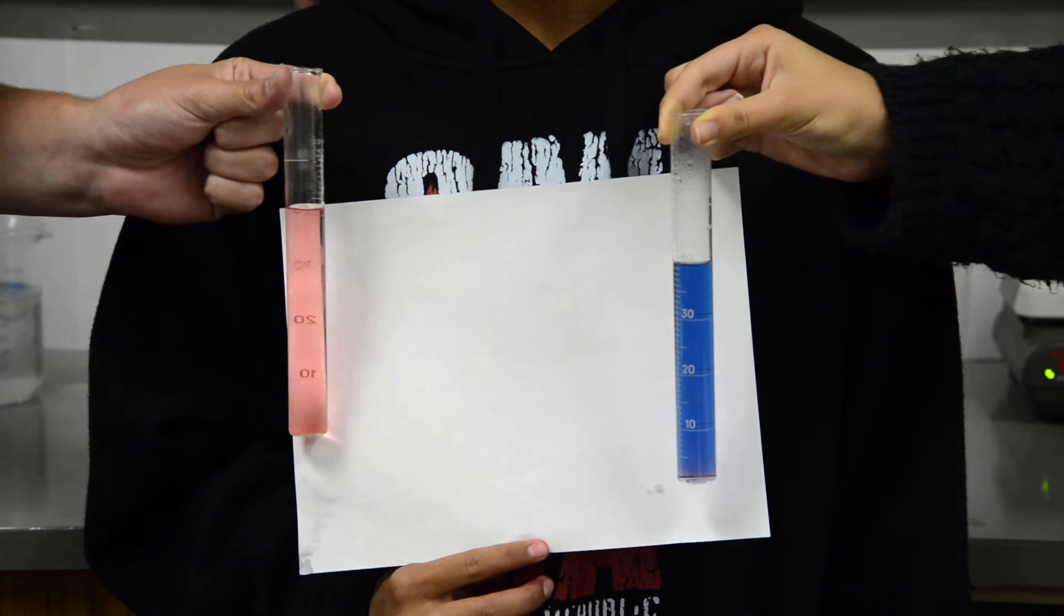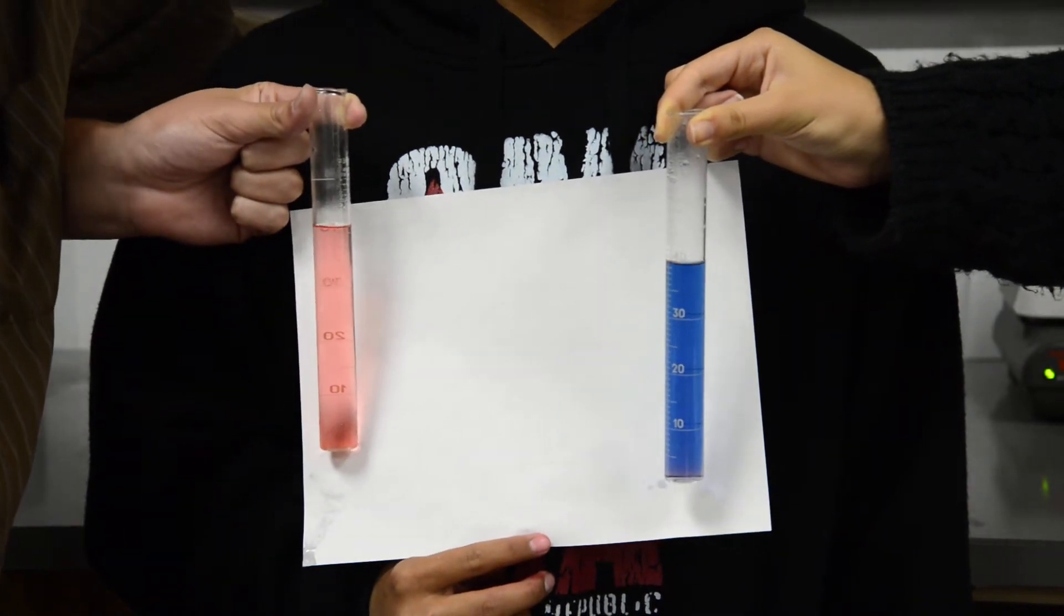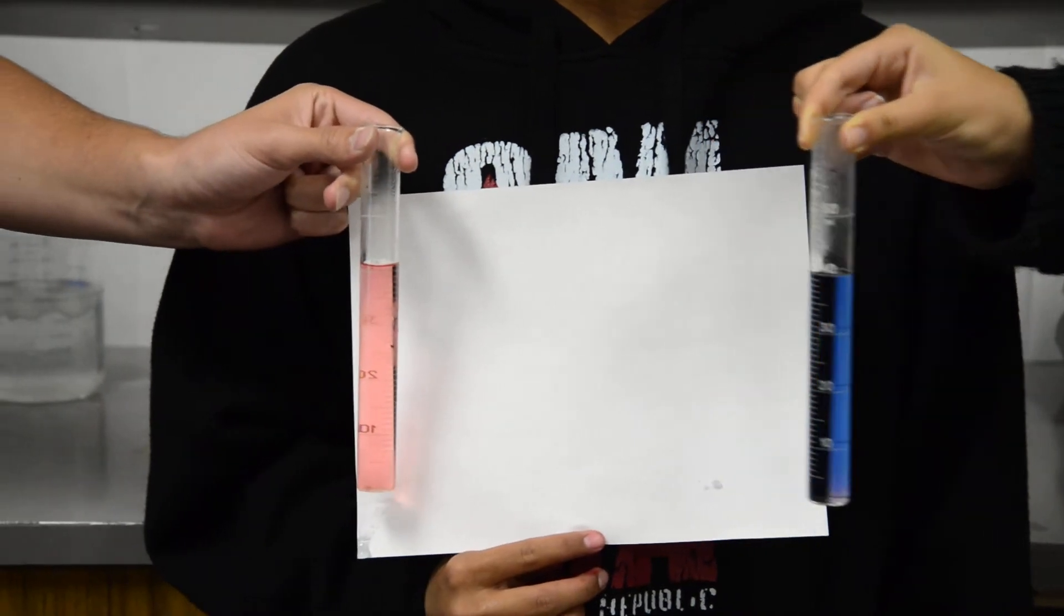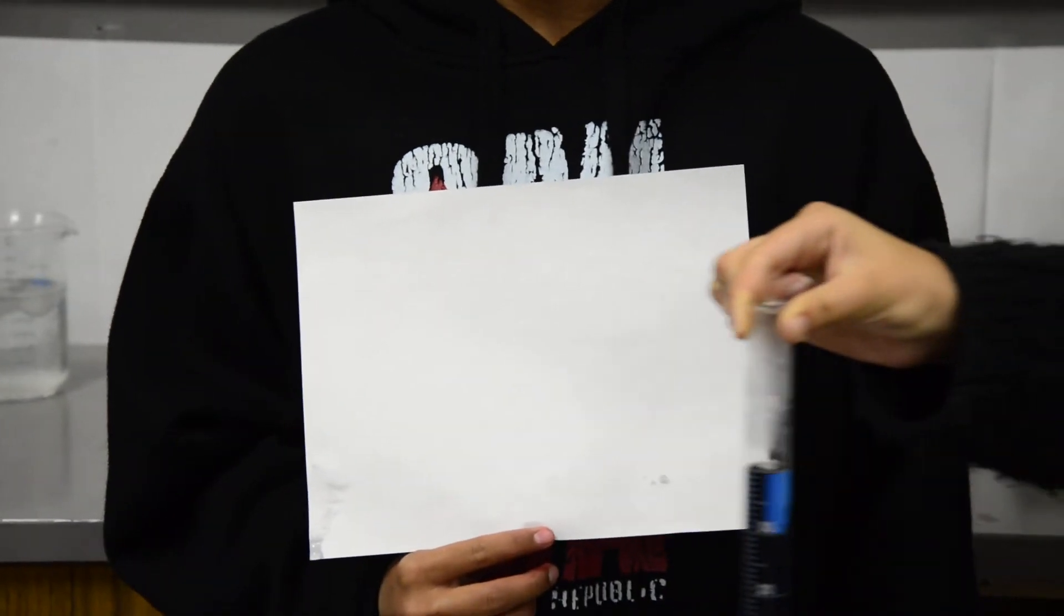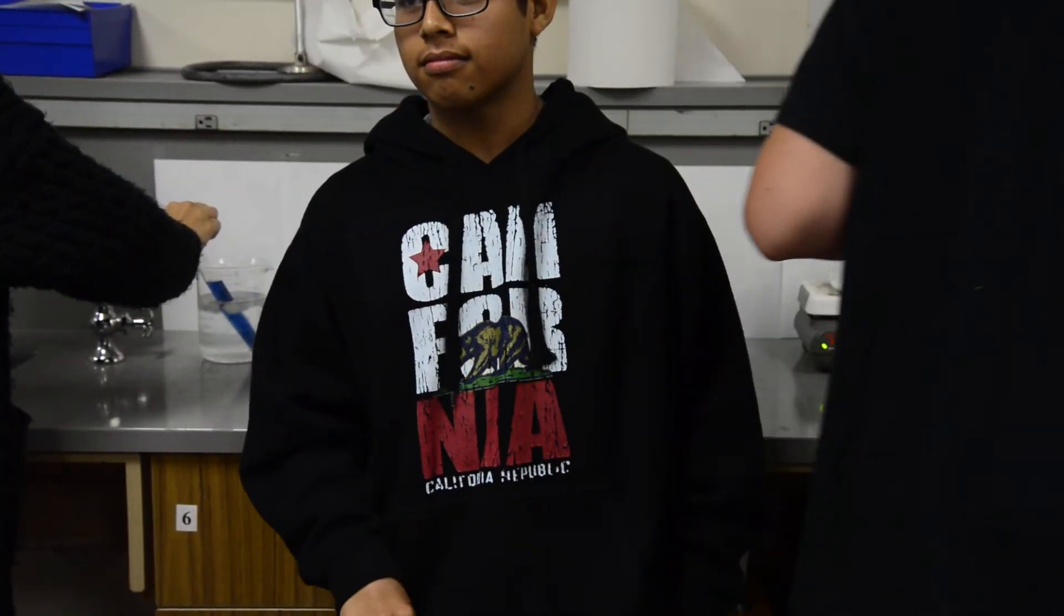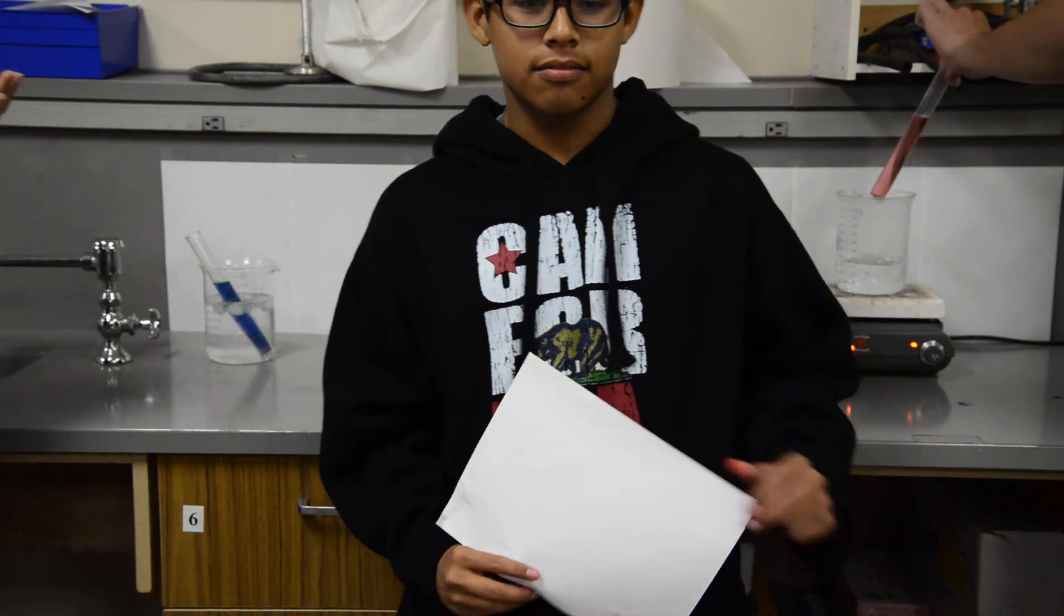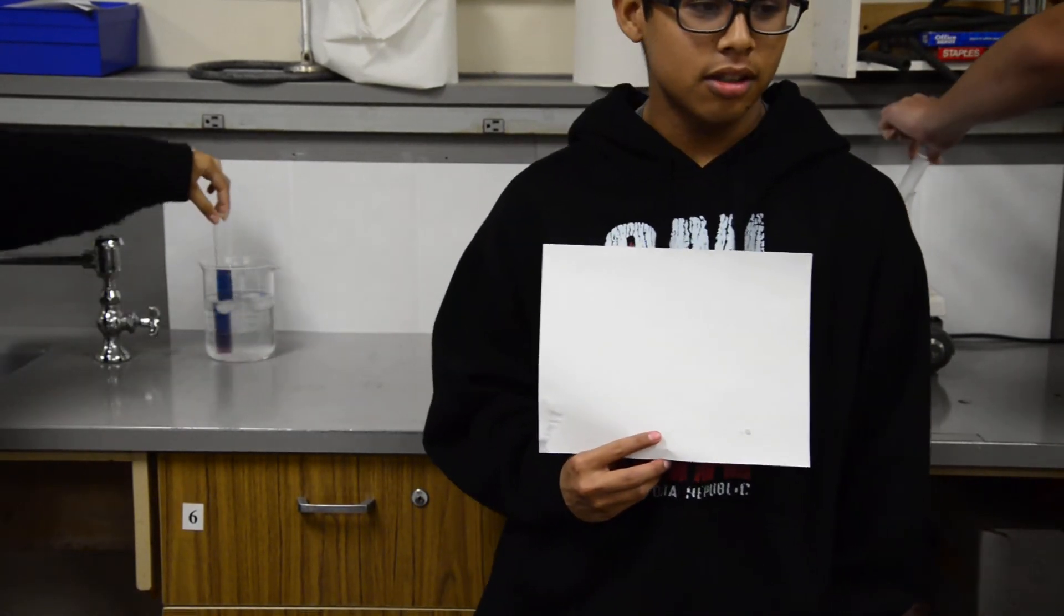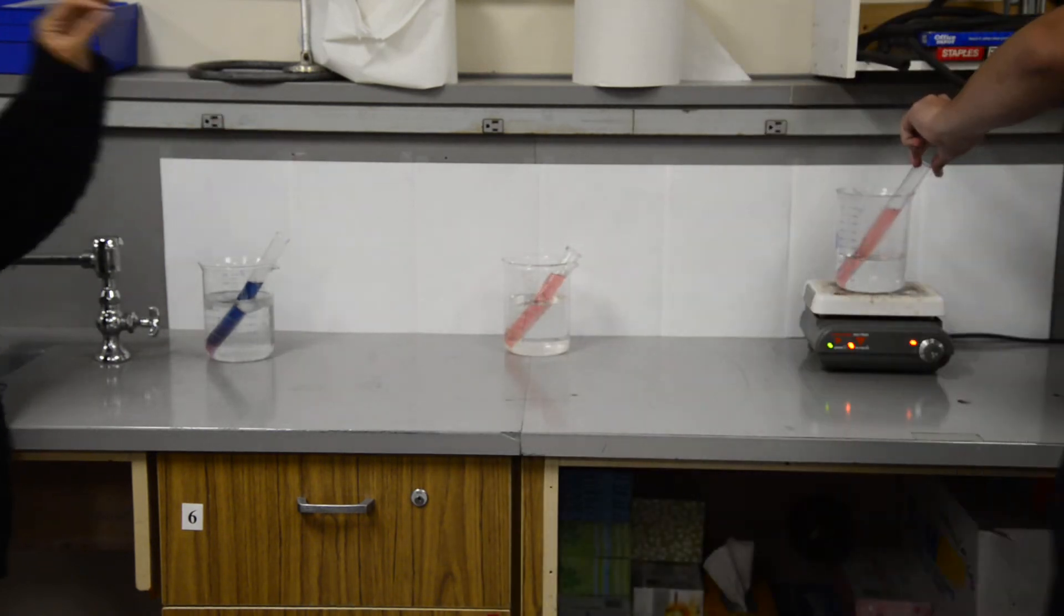I'm putting this back in the water that is at room temperature and we're going to now switch. The hot water tube is going into the ice water bath and the ice water bath tube is going into the hot water bath.